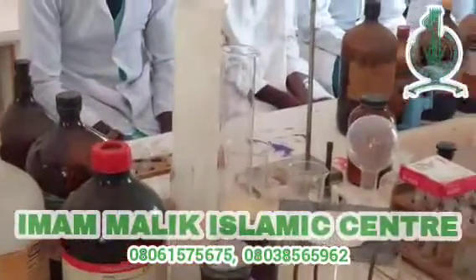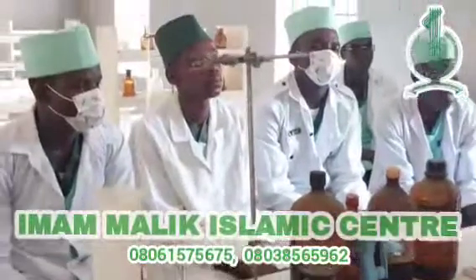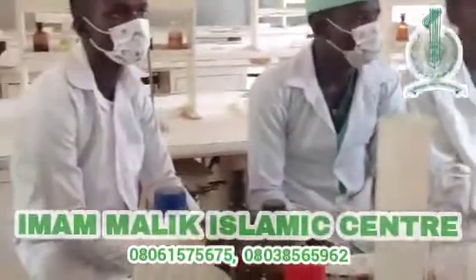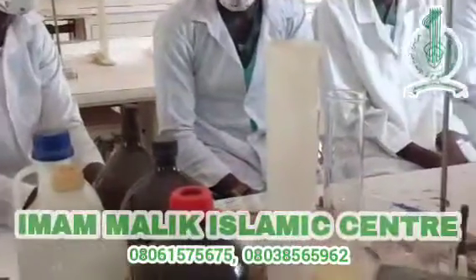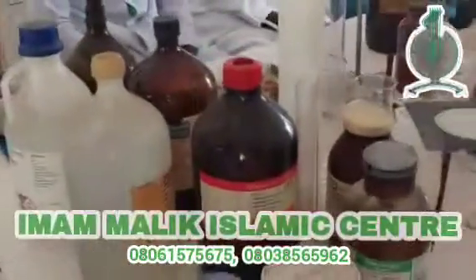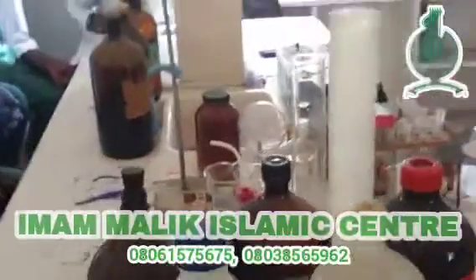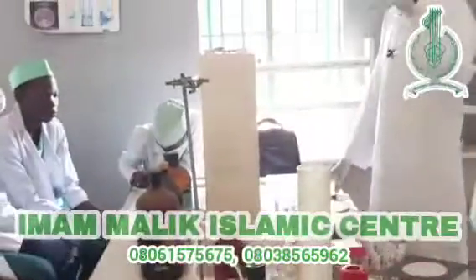Then you are in the laboratory, and we say the laboratory is a place where we keep chemicals, where we keep all these apparatus. And we all know that some of these chemicals are dangerous to our life when we inhale them or when they touch our skin and the rest. That is why we are wearing all this lab coat and the rest, right? Yes. Then what are the laboratory hazards?